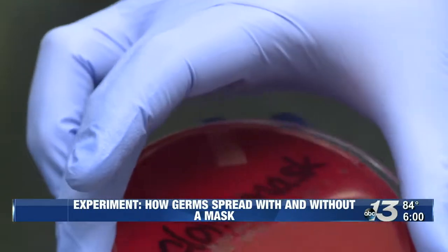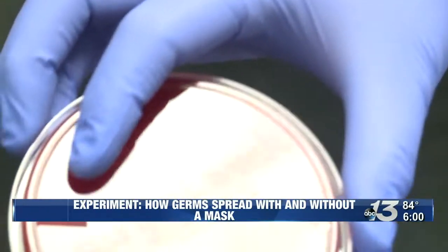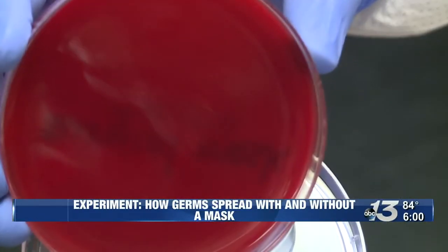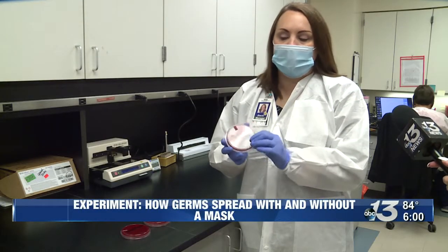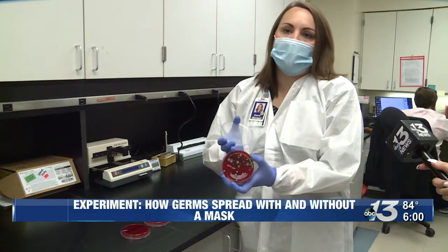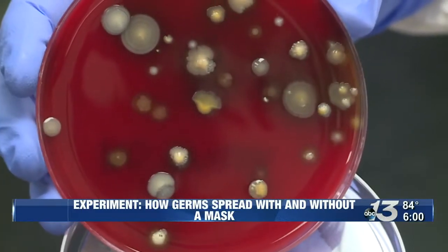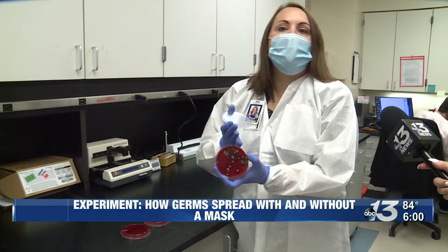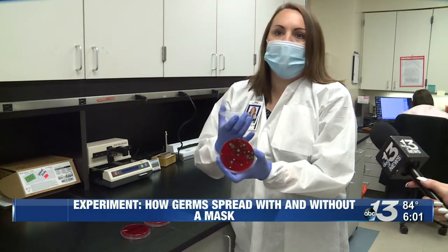With a cloth mask, you can see that nothing came out. As was the same for the surgical mask. The cloth masks and the surgical masks are about the same. And finally, the moment of truth. And a quite visually disturbing one to take in. Many bacteria came out. Coughing with no mask cultured these colorfully earthy circles. Germs. Respiratory secretions produced normal flora that comes out when you're speaking.